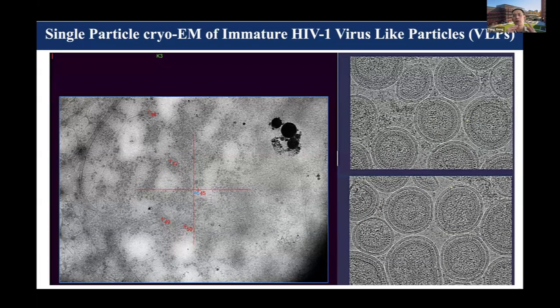So we are going in situ, meaning in the native virus environment, using virus-like particles, VLPs. Virus-like really means we made mutations to the virus, say, to get rid of the virus envelope or spike. So it's not infectious, and we can handle it in our BSL-2 microscope. On the right are some micrographs of the viruses. You can see the nice lipid bilayer. Then underneath, you see some regular pattern. That is the capsid lattice.